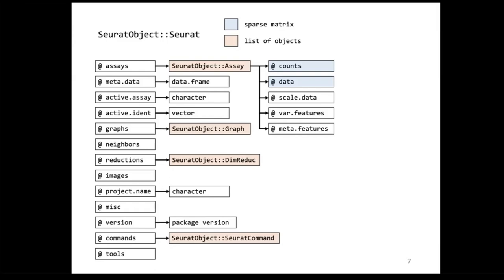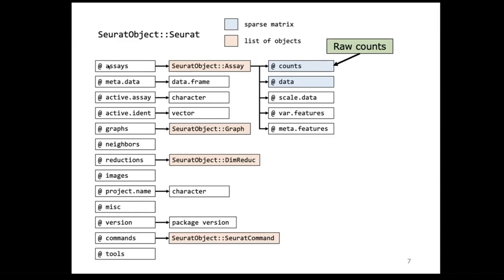What is always filled in a Seurat object is the Assays slot. You can think of an S4 object like a list of named slots. The Assay slot contains another S4 object called Assay, which has its own slots including: counts (the raw counts generated by CellRanger), data (normalized data), scale.data (scaled data), var.features (the variable features, if selected — otherwise that slot is not filled), and some metadata about the features.